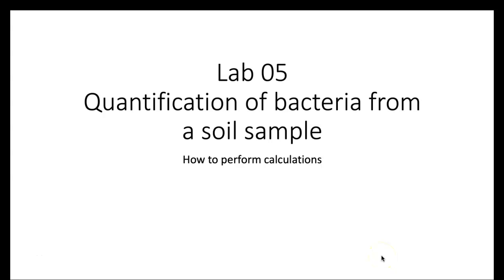So this is part of Lab 5 where I want to talk about the math that's used to actually quantify the bacteria from a soil sample. So it's describing how to do the calculations from the information that you obtain from actually performing the lab. So there's a variety of things that you have to keep in mind.